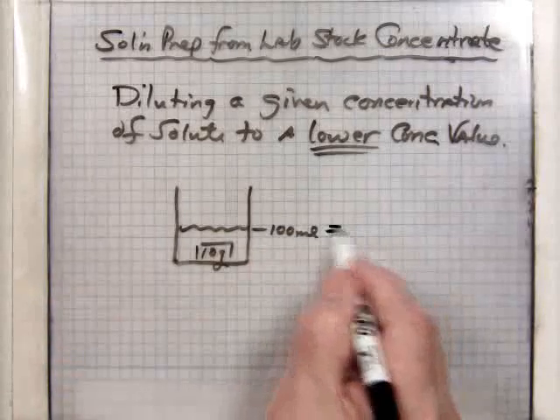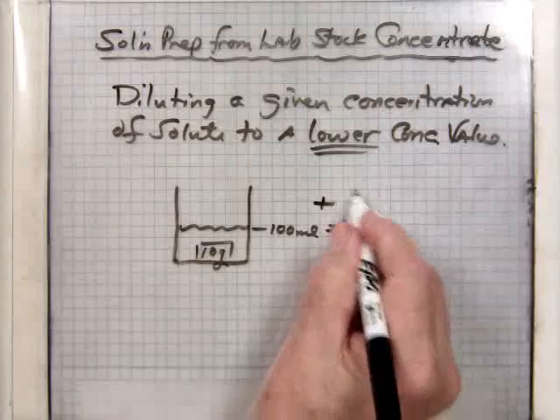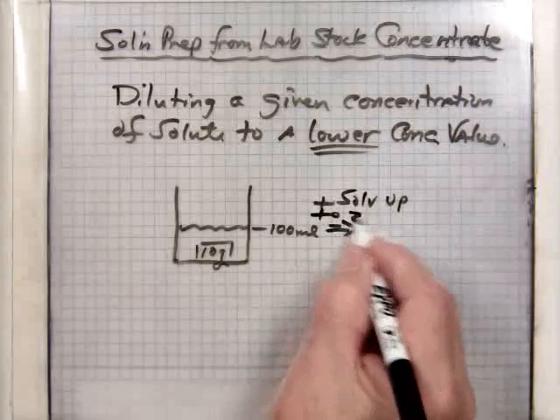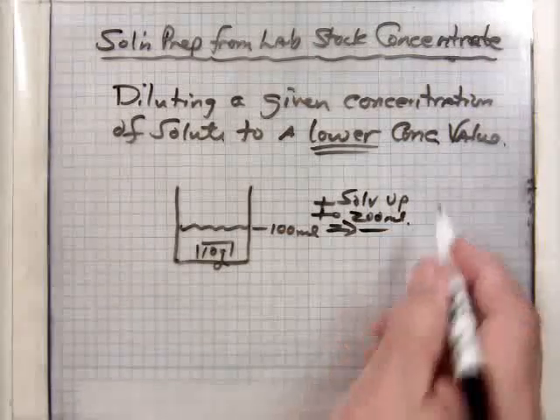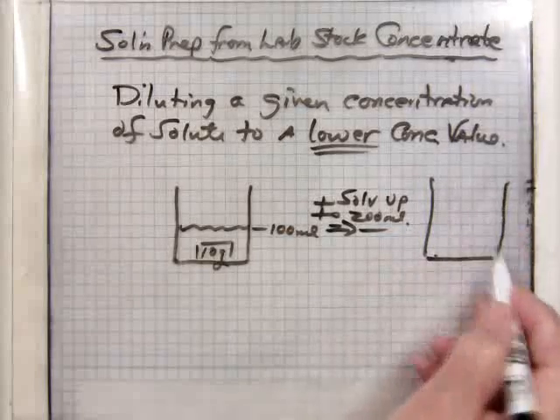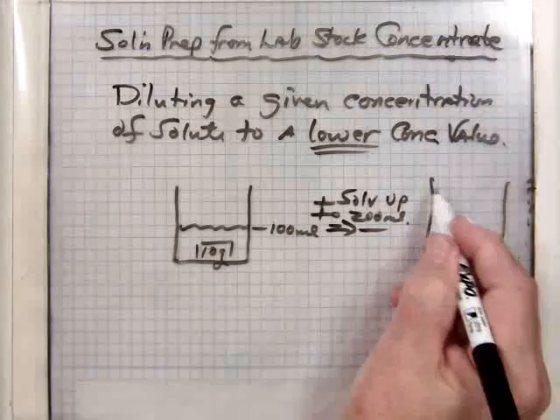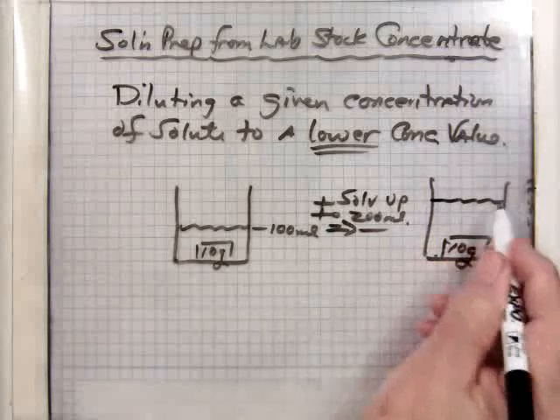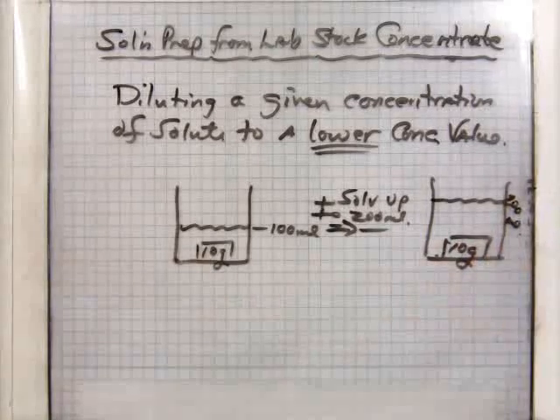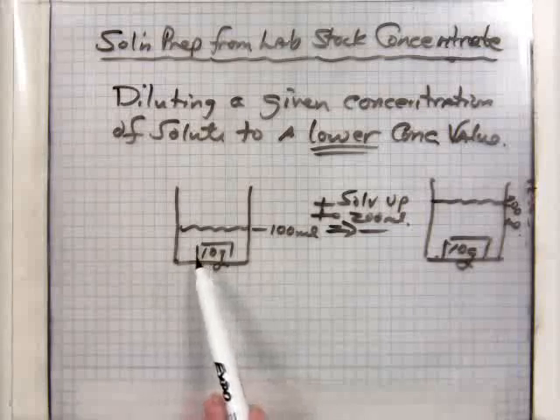Now, plus then you add solvent up to 200 milliliters, okay? And so now your solution is up here, like that.